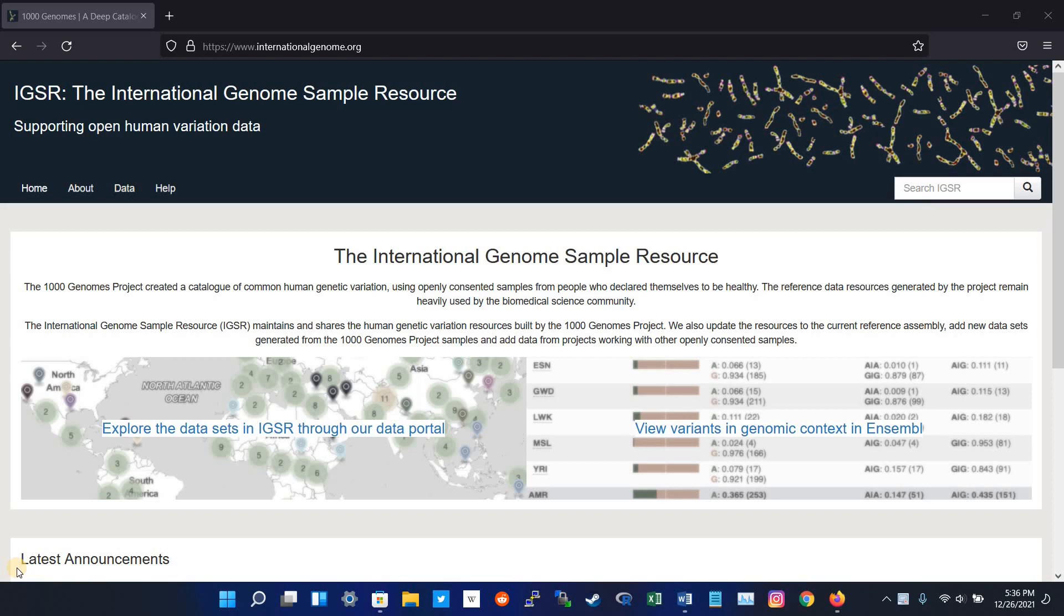The easiest way to access Thousand Genome frequencies is from the dbSNP Database of NCBI. So let's check it out.